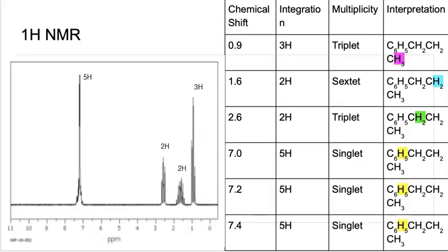Our final one we want to look at is the 1H NMR. You may notice that there are only 6 signals here, as opposed to our 13C NMR structure that was 7 signals. The main reason for this is that on the benzene ring, the carbon that is attached to the propane chain is going to have 4 bonds attached to it, thus not allowing a hydrogen to attach, which means there is no 1H signal coming from that carbon. So we lose one signal from 7 to 6.